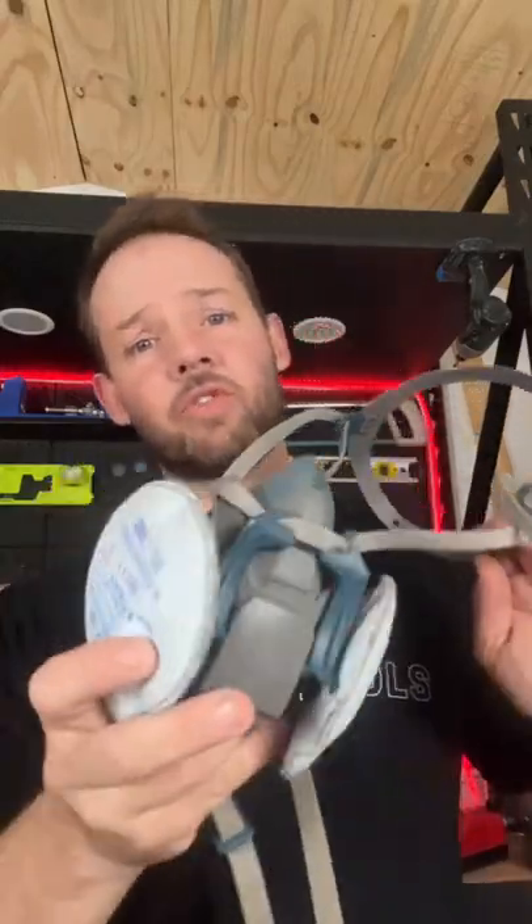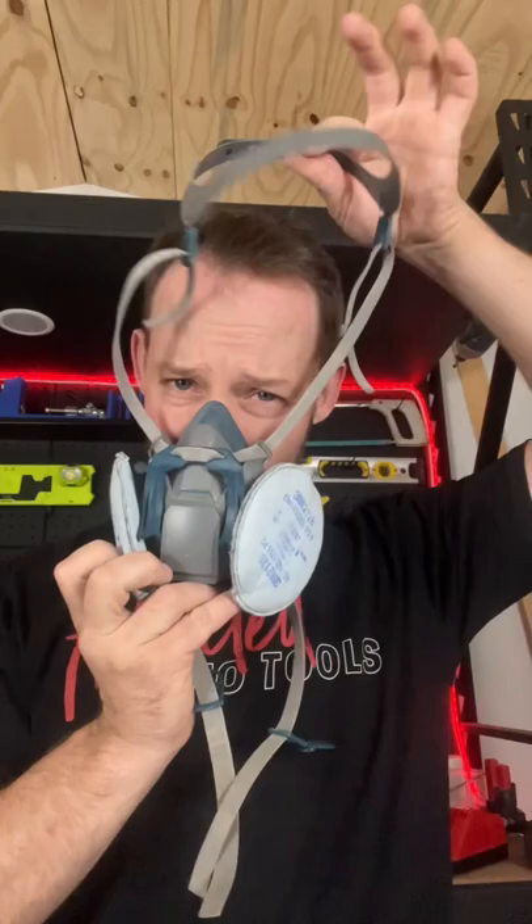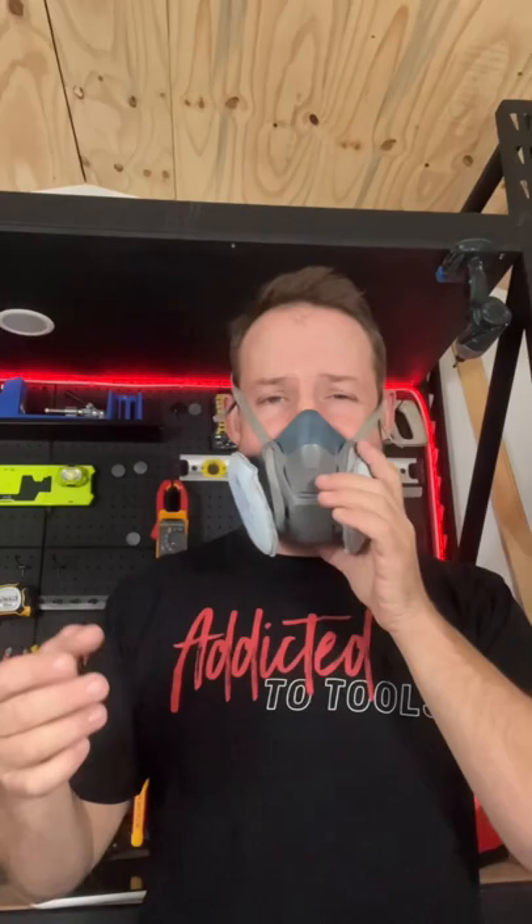The mask is from 3M, part number 6502. This part goes over your head, and this part goes around the back and clips on. Pull down this part here to lock it in — it sits in there nicely. To unlock it, just pull back and away you go.